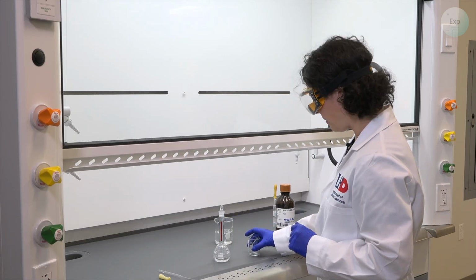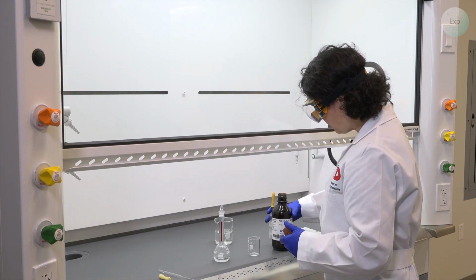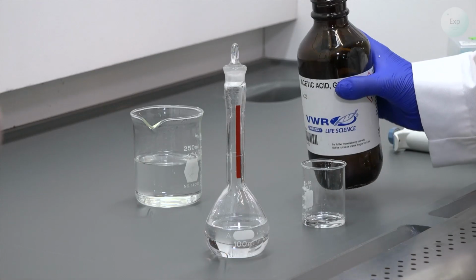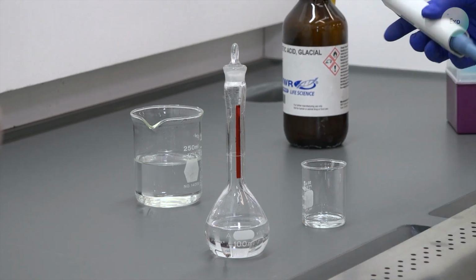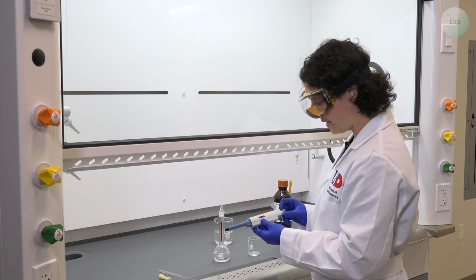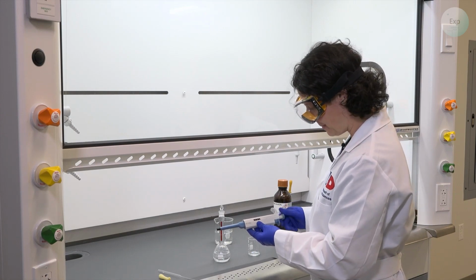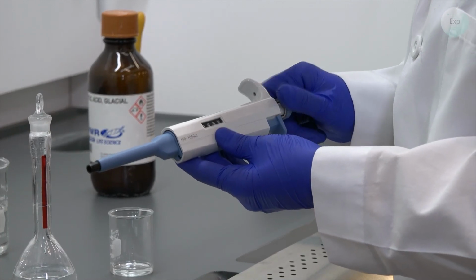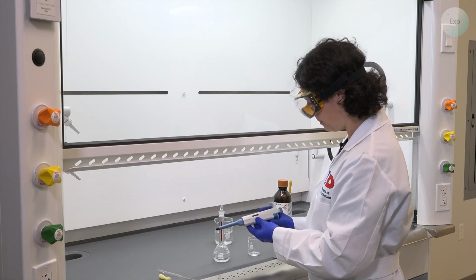Next, we need to measure out the amount of acetic acid. First, we're going to transfer some into our beaker. We just need a small amount. Then, based on our calculations, we need to set our micropipette to the right amount. Of glacial acetic acid, we're going to require 0.575 milliliters. So we just dial it to that number. When we get to the right number, we stop.